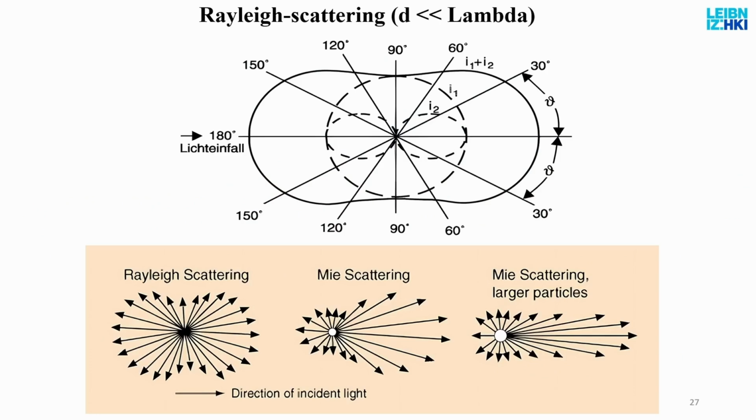So those are the four basic aberrations. They can be compensated for also afterwards to some extent. They can be described mathematically. I will not go into that; we teach a whole semester class. We do learn about that, but today we don't have time.